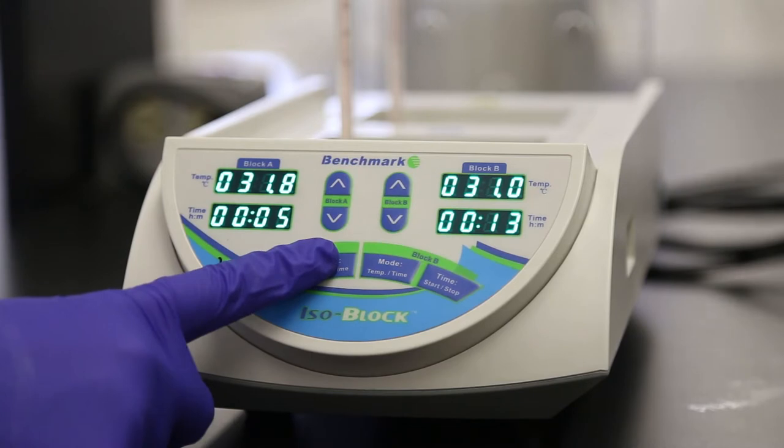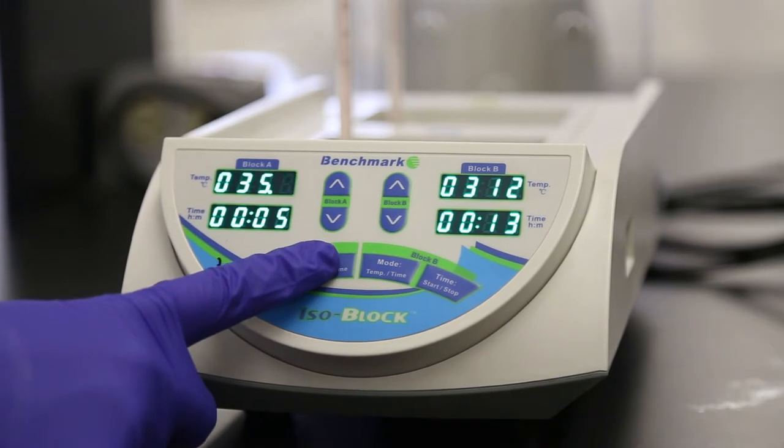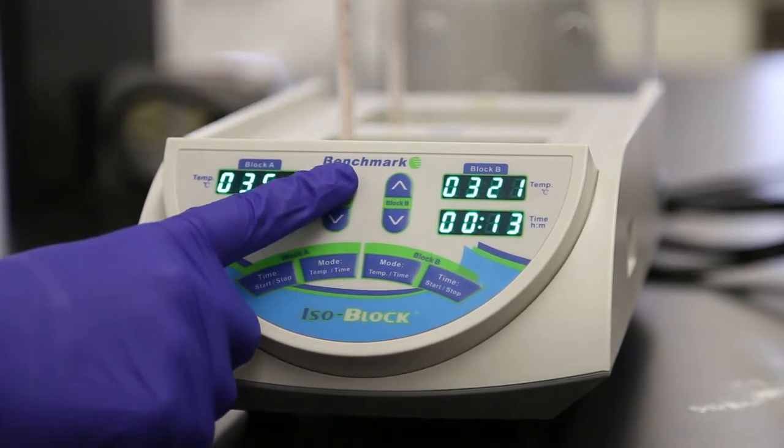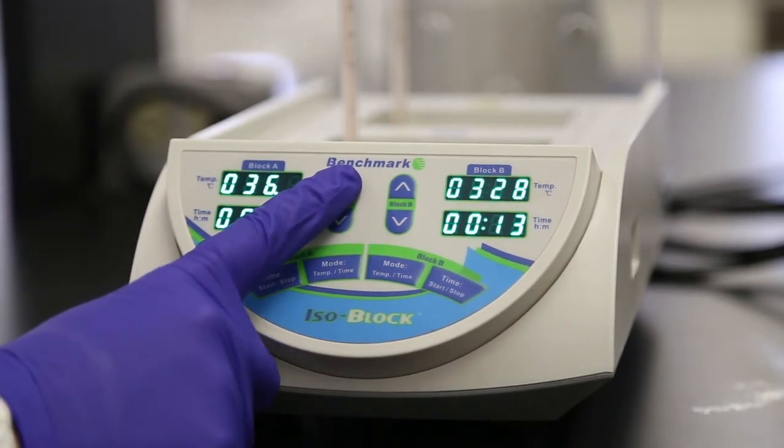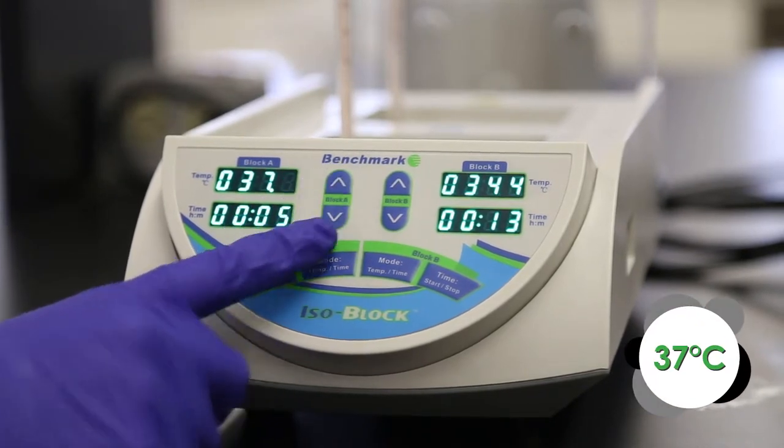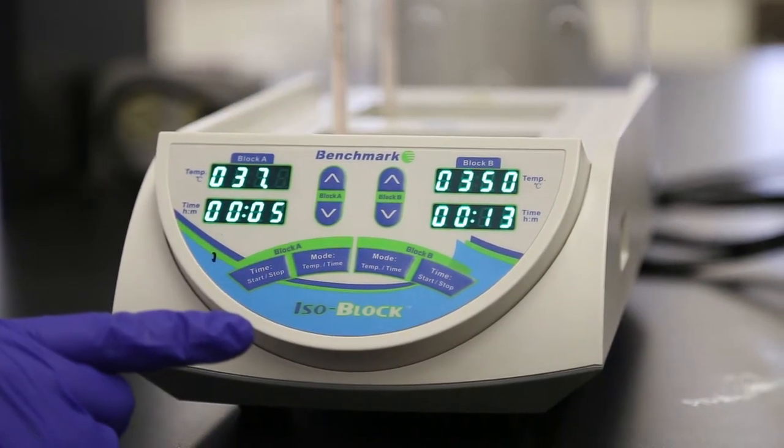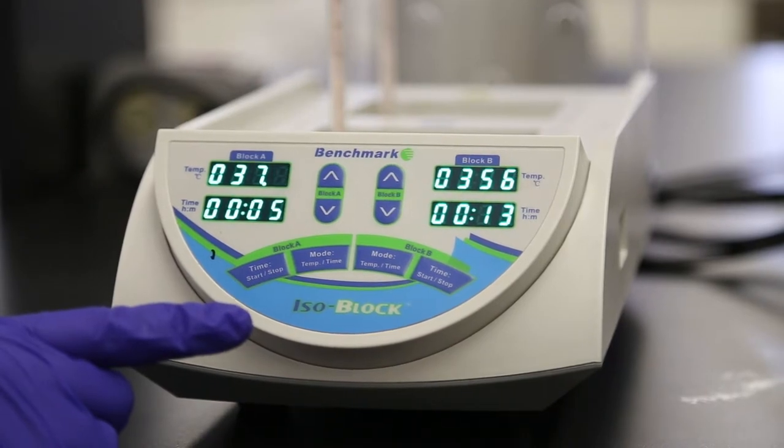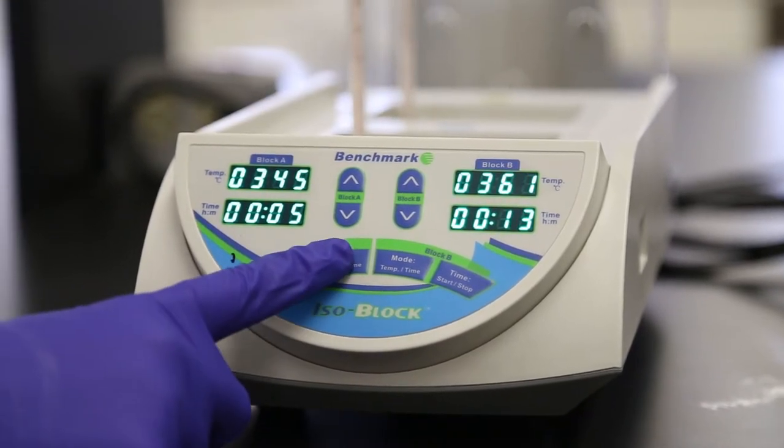Press Mode, Temp, Time for Block A once to select the temperature setting for the block in the rear of the unit. The last digit of the temperature's display flashes indicating the selected field. Using the Block A arrow keys, press and hold up or down to adjust the temperature setting to 37 degrees Celsius. Holding down the button adjust the setting temperature faster. The block immediately starts heating.